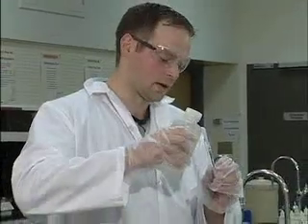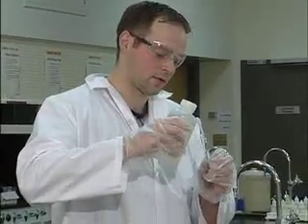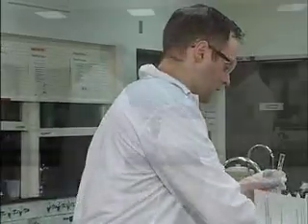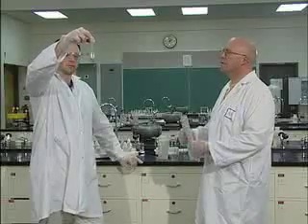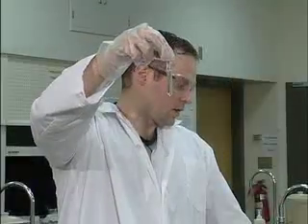Do they have one in here? They do actually. Oh, there is one in there? Yeah. All right. So what you're going to do is fill this about 3/4 full. And to me, 3/4 full is just below the white line. Okay, now to that. That's just water?